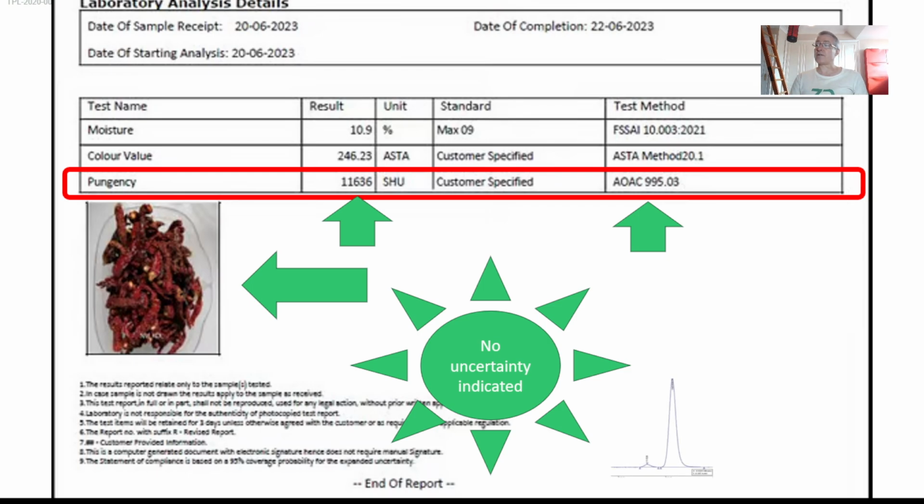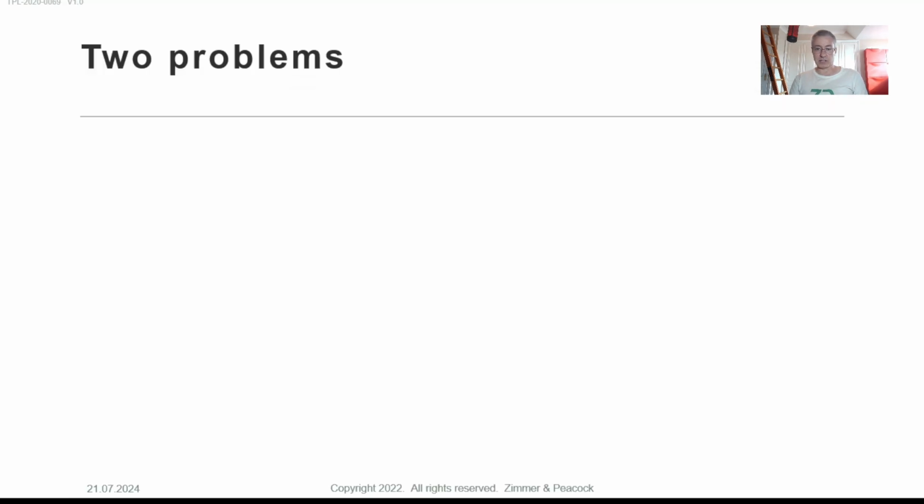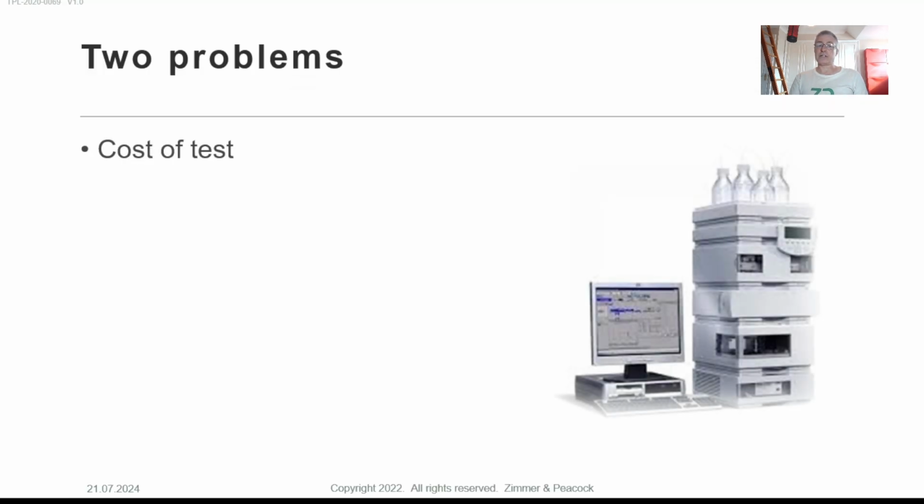So we have HPLC. There's no indication of when the system was last calibrated. So you end up with people believing the results, but when you try and dive into the science behind these results, especially from HPLC.